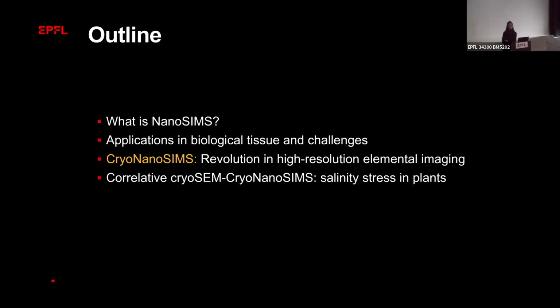So to give you an outline of the talk for today: first, I thought I would introduce the topic of NanoSIMS and what the NanoSIMS is as a technique. Then, what are the applications we have so far where NanoSIMS has been used in biology, and the challenges that we face in the application of this technique to biology, and how this has been overcome now with the help of a cryo-NanoSIMS. And I will talk about the workflow that's been developed for the correlative imaging, and use salt stress in plants as an example to show a real application of the cryo-NanoSIMS imaging technique.